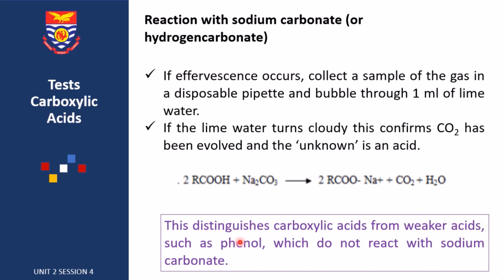So sodium carbonate reacts with carboxylic acids. However, it does not react with weak acids, such as phenols. So this test may not be an outright test for the presence of the carboxylic acid functional group. However, it's a confirmation test, because confirming the formation of carbon dioxide tells us that the compound is acidic and it's possibly a carboxylic acid functional group.